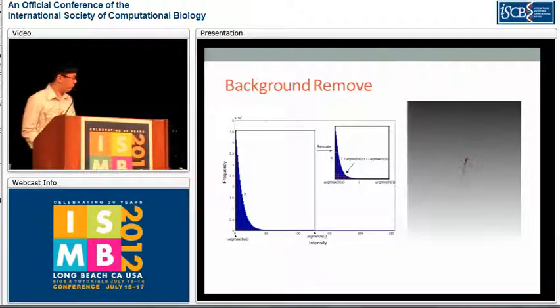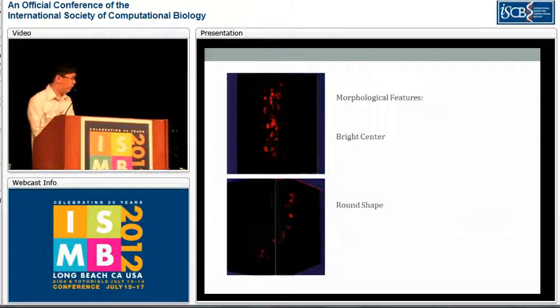First, we crop out the region from the maximum of the frequency to the lowest of the frequency, and then we normalize the histogram, which makes the intensity and the frequency have the same scale. Then we can determine the threshold by finding the minimum of the summation of the intensity and the frequency. You can see the result of removing the background, which is much clearer than before.